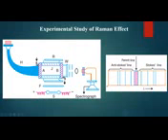The parent line or incident line is very intense, having very high intensity, and Stokes lines and anti-Stokes lines have comparatively less intensity. Remember, the lines with wavelength higher than the incident light in the Raman spectrum are called Stokes lines. The lower wavelength lines are called anti-Stokes lines.